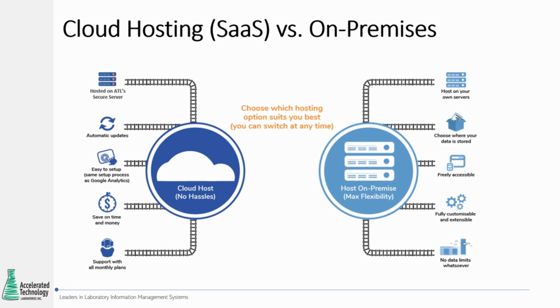Every probably 2 to 3 years, they would replace them. They would have to be responsible for network switches, all the software that went on that server, antivirus software, backup software, Windows, Citrix if they were deploying their solution to their workers remotely. So there's a lot of challenges to managing an on-premise solution for the laboratory. You are basically responsible for everything: managing and maintaining it, applying updates, monitoring disk space.